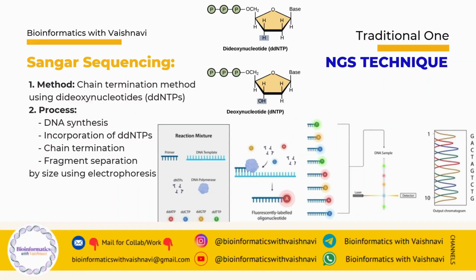So let's see. Before NGS, DNA sequencing was mainly done using Sanger sequencing. Let's briefly understand how Sanger sequencing works.